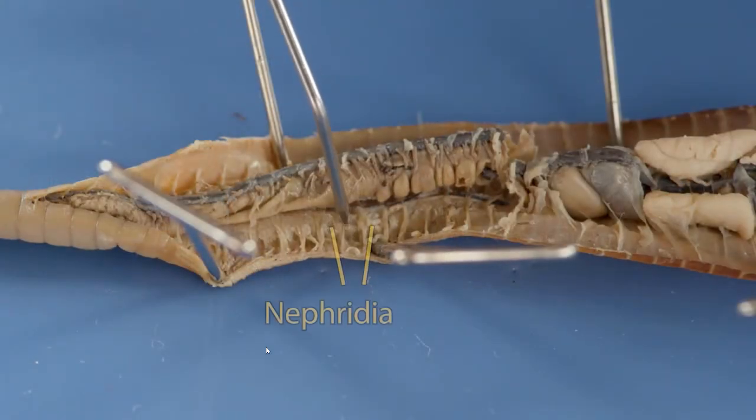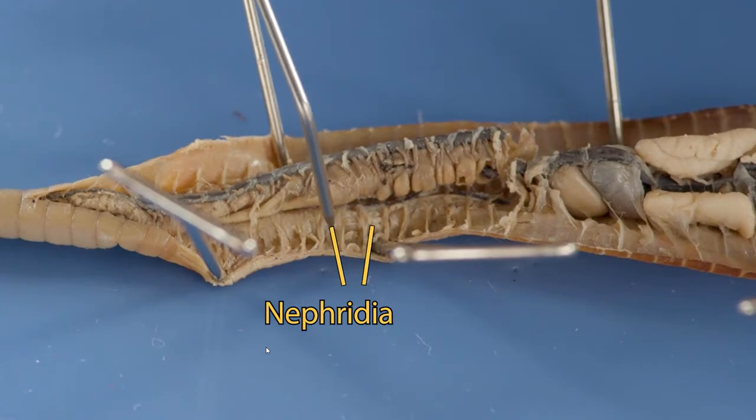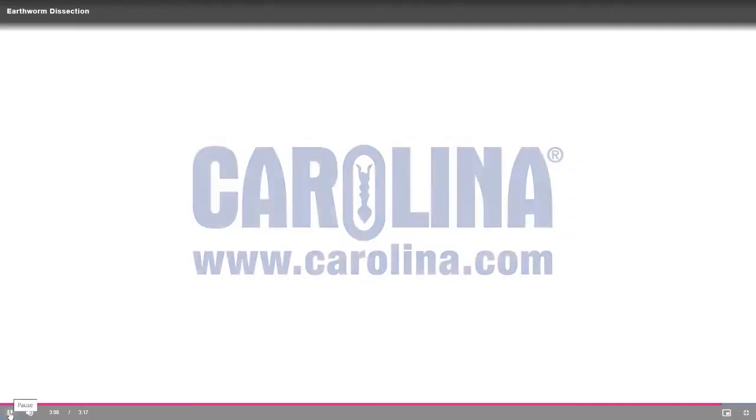Locate the excretory organs called nephridia in each segment. These specialized structures remove nitrogenous waste from the earthworm's body.